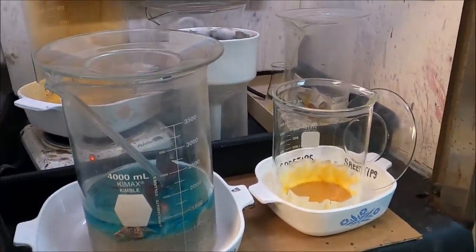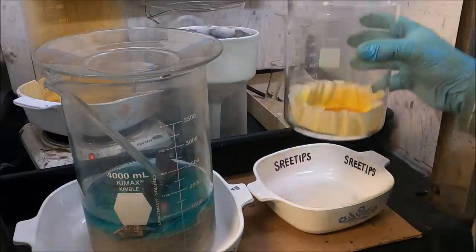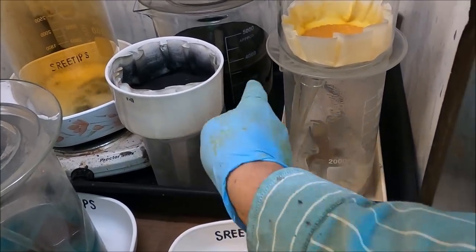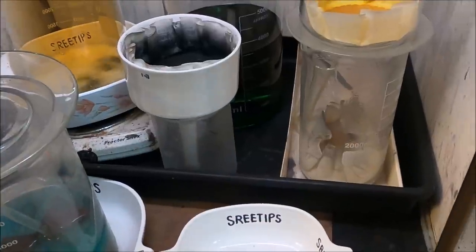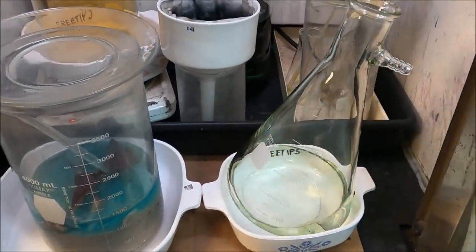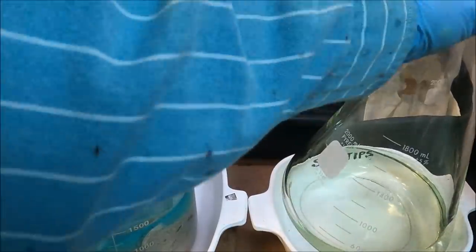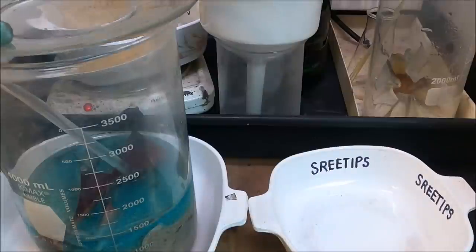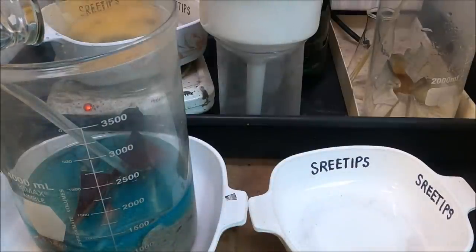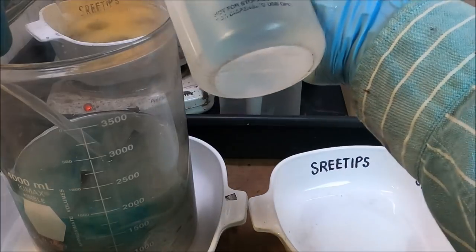Time to do a quick little review here. This is the palladium that I just precipitated out of the solution. Our solution that I precipitated it out of is sitting in the back there, and what I'm thinking is we're going to have some gold that precipitates out of that in the morning. Set this up here out of the way. Now what we'll do is I'm going to add the solution, which is going to have a little bit of silver in it, so I'm going to pour it into this beaker that has some copper in it. Cement this out. And then we can go and do all the dishes.